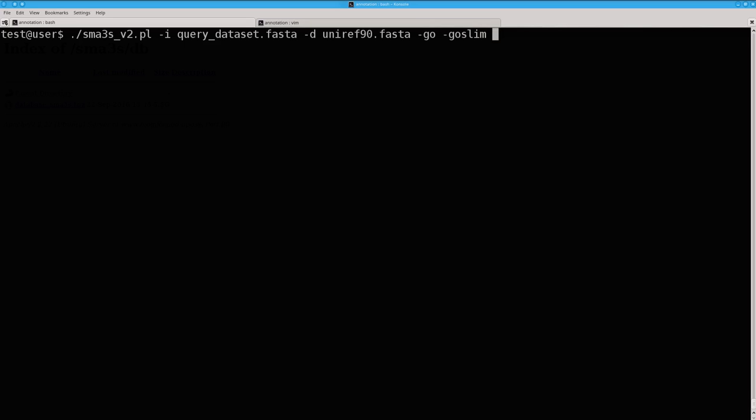We use the GO argument for obtaining the names for every annotated GO term, and GO slim for obtaining generic GO terms useful to later analyze functional categories. If you want to annotate a transcriptome, you must add the nucl argument. But in this case, it's not necessary.